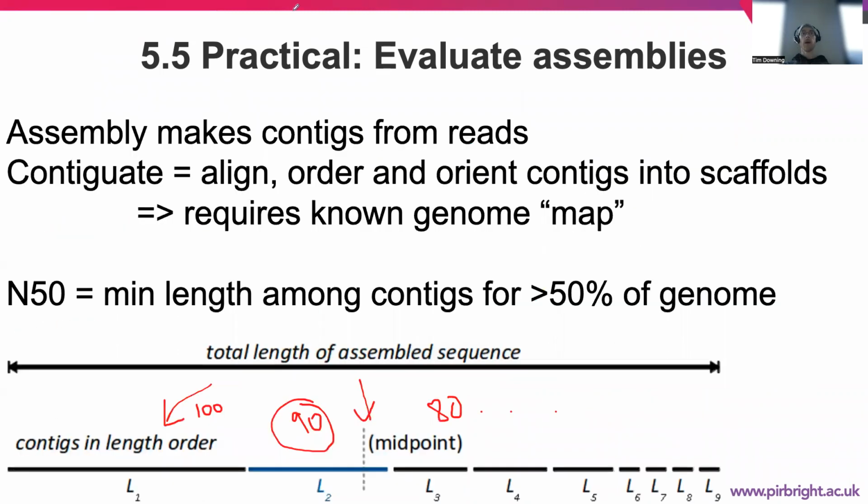So what we do with our assembly, if we have contigs for host and vector genomes, is convert our contigs into scaffolds, and these scaffolds into chromosomes. And what we want to do then is use the best reference we can access to align, order, and orient these contigs into scaffolds. So we compare them to a reference, we order them in the right order.